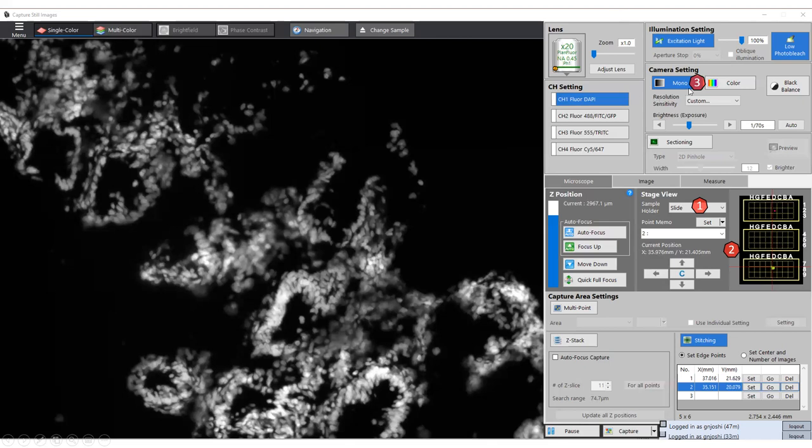So third is if you are imaging for fluorescence, click on the monochrome camera. Once you have clicked on the monochrome camera, the next goal is to set up the imaging parameters, and I would do that looking at every single channel that you have a fluorophore for. So I will go on the single color and click on DAPI, FITC, TRITC, or so on, whatever you have as your fluorophore. Adjust the right kind of an objective, either 4x, 20x, 40x, or so on.